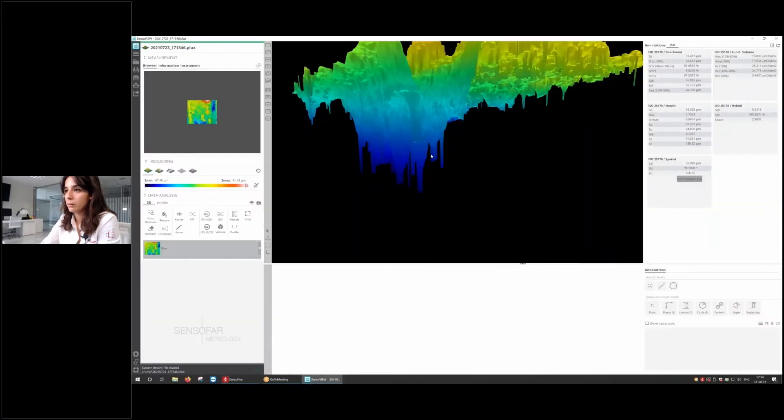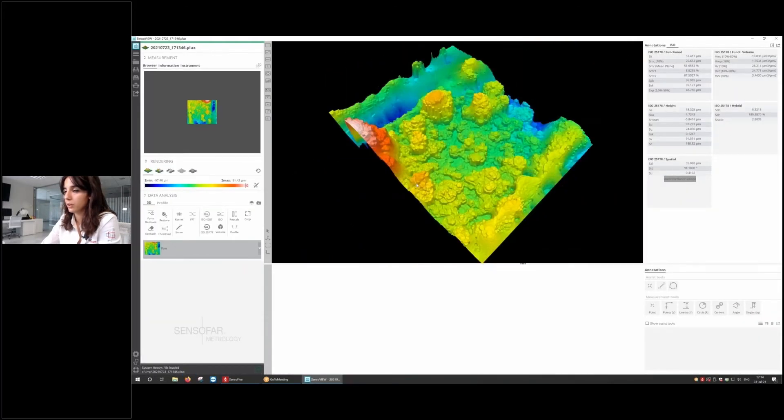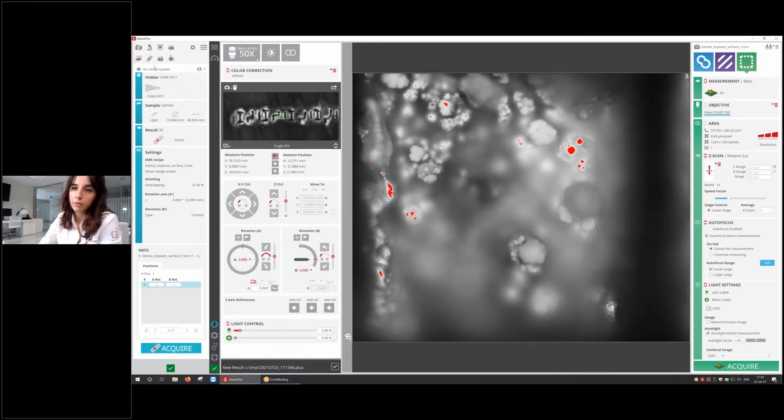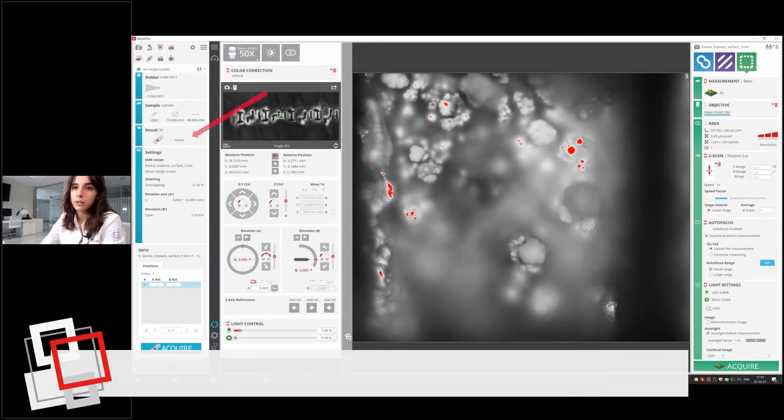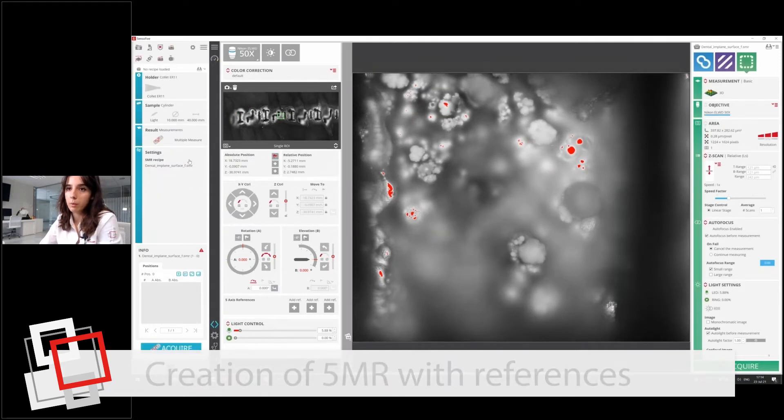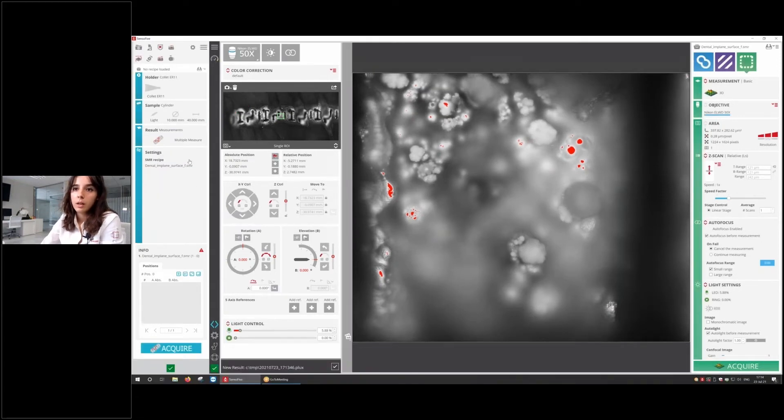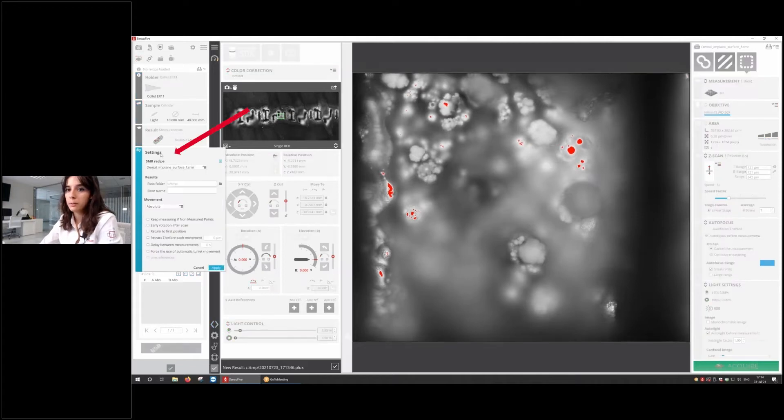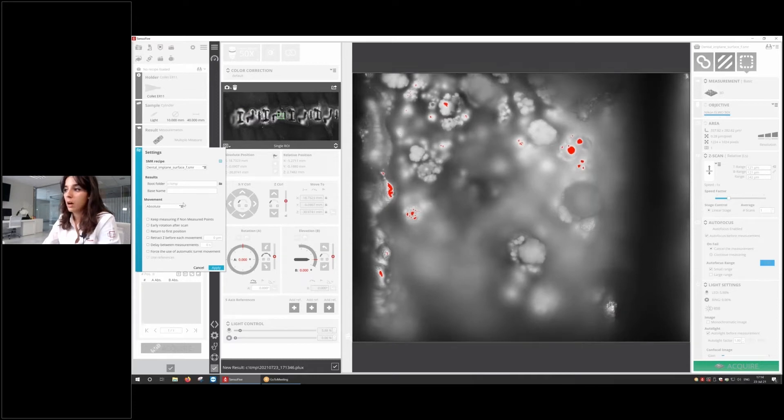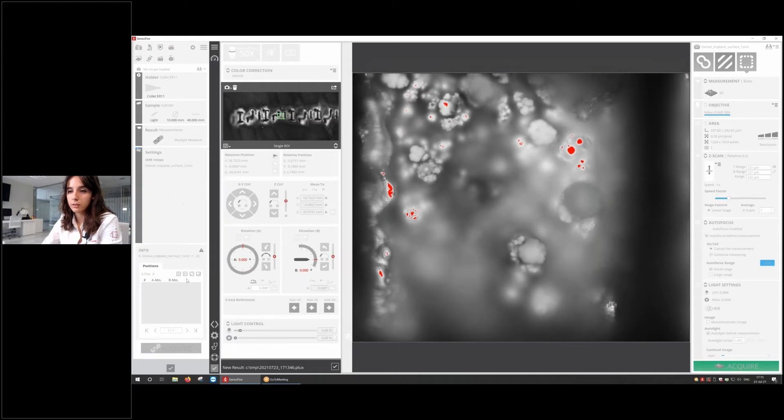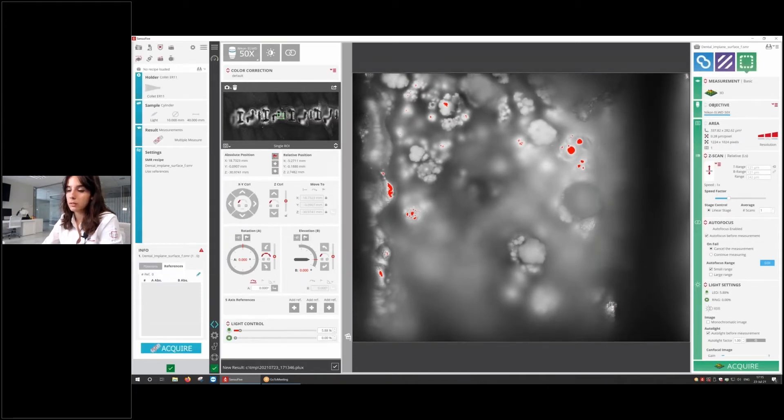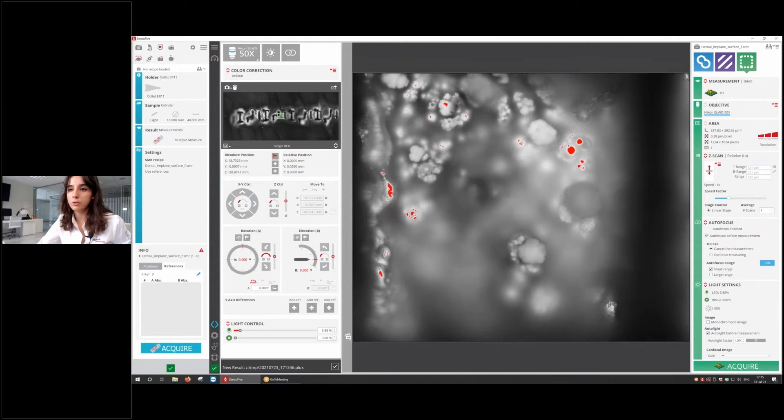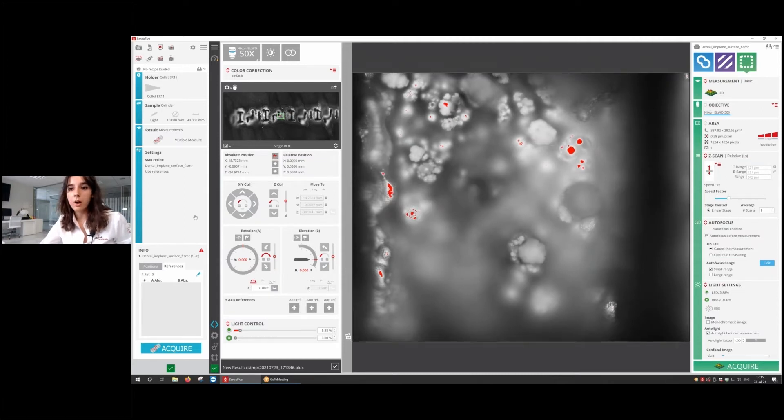If we have a look at the image, this looks pretty good. We can save our recipe, and then we can go to the part of the five axis and create a 5MR, which is manual and multiple. One thing we need to do is open the settings and change how the movement is going to be. In this specific case, we're going to use references, and to do so, we need to use relative movement. We're going to check the option of references. The references need to be established before we set the other positions, because the other positions are going to be relative to those references. I'm going to save this position, and now I'm going to establish the references.